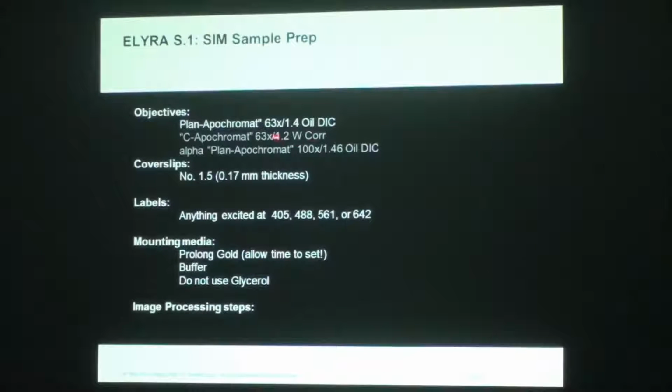So basically it is rendered in 3 different objectives. The Zeiss makes it usable with 3 high NA optics, but the one we have right now is the 63x 1.4. And if you need, you can put a 100x, but I will give you a comparison of the different NA and the objectives and the immersion media against the improvement in the resolution in a bit. So typically you want to use highly quality controlled cover slips, 0.17 plus or minus 0.001 millimeter range of correction on your cover slips would be much better, to avoid the spherical aberration.